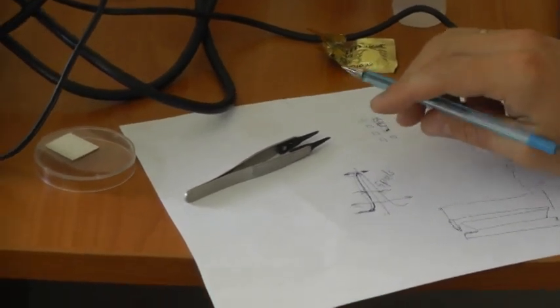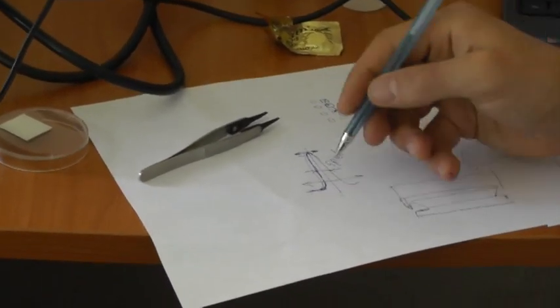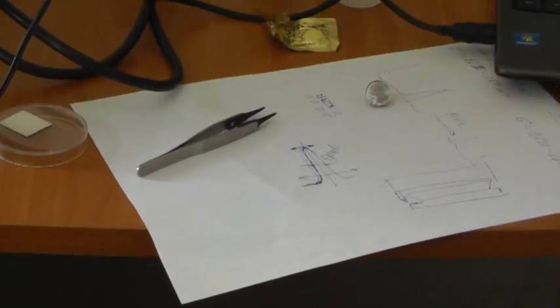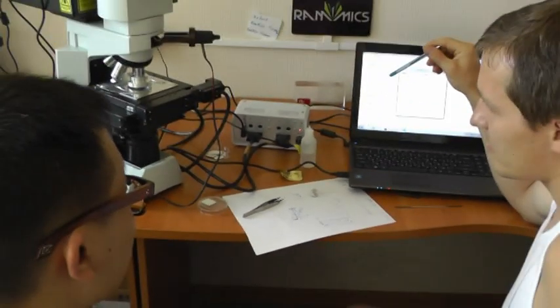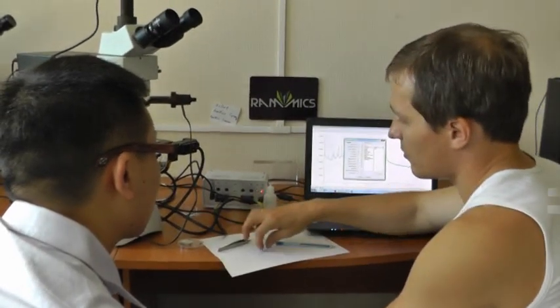It is just an optical, artificial effect of focusing of the laser beam on the CCD surface, and the auto shift value is set empirically. We know it should be about 100%, or no more than 100% of the line width.